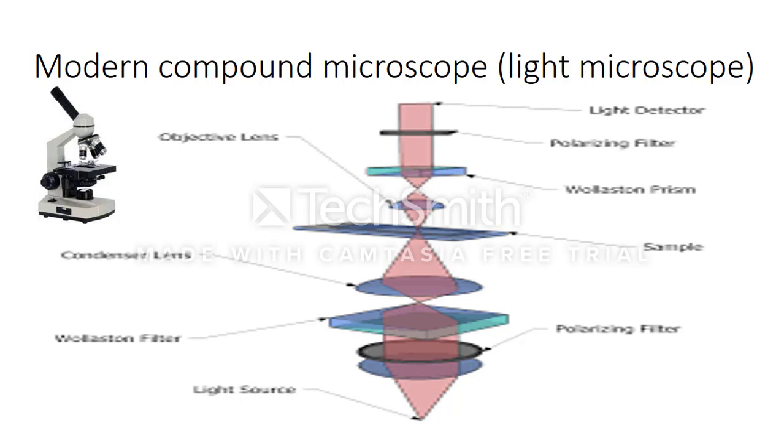So as you may know, a wave with higher amplitudes is going to give light that is more light, I can say, and one with lower amplitude will give a dimmer light.